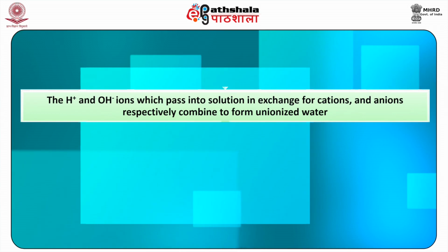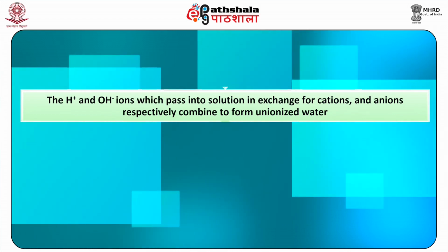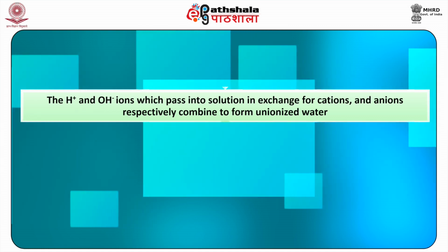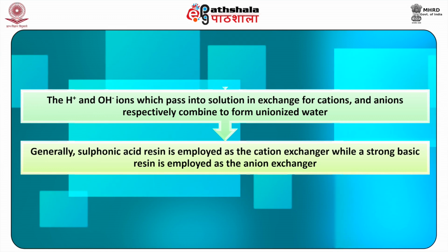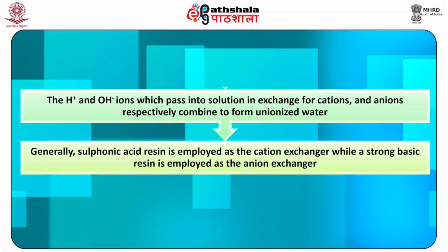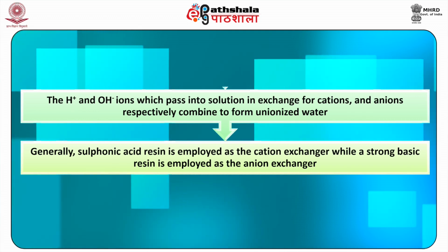The H plus and the OH minus ions which pass into the solution in exchange for the cations and the anions respectively combine to form the unionized water. Generally, sulfonic acid resin is employed for the cation exchangers, while a strongly basic resin is employed as an anion exchanger.